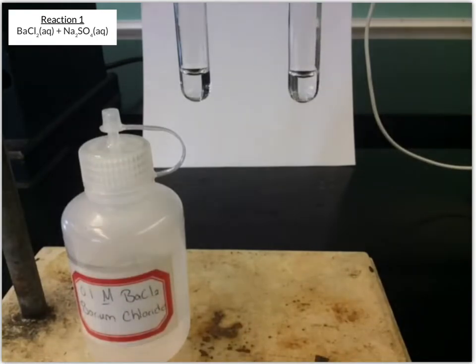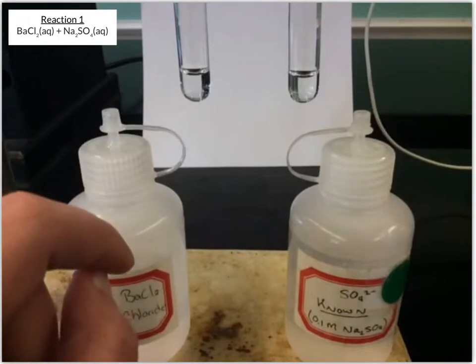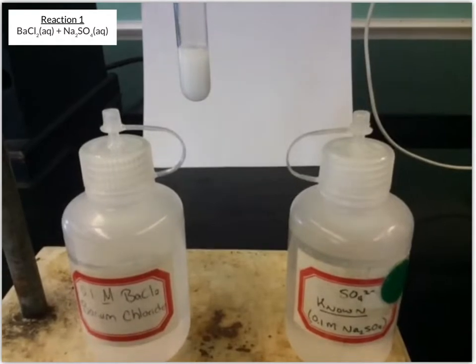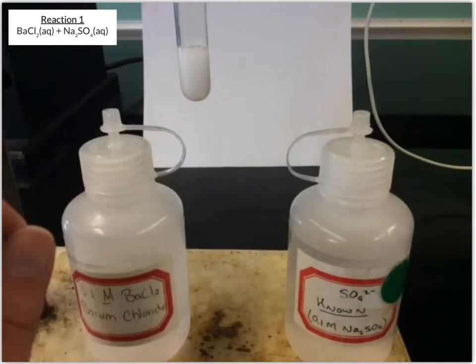Okay, so we've got our barium chloride, sodium sulfate, and you can see these solutions are just clear, colorless solutions to start with. And I'm going to go ahead and take this sodium sulfate solution and pour it into the barium chloride solution so that then they can react. And you could see right away it changed. It went from these two clear colorless solutions to now what looks like a white solution.